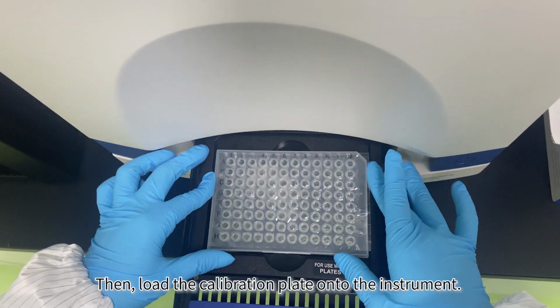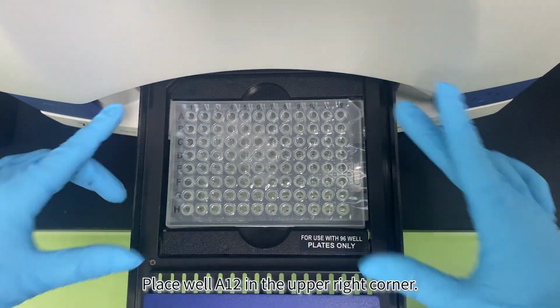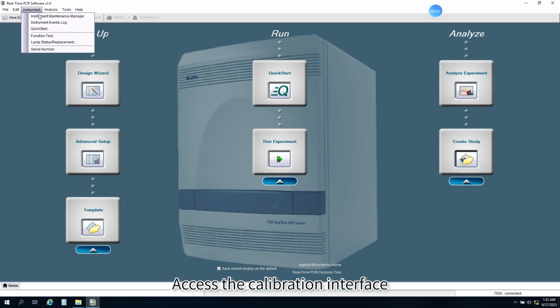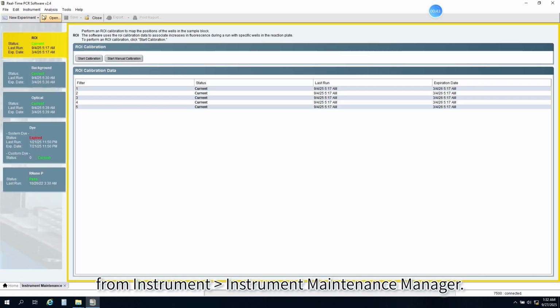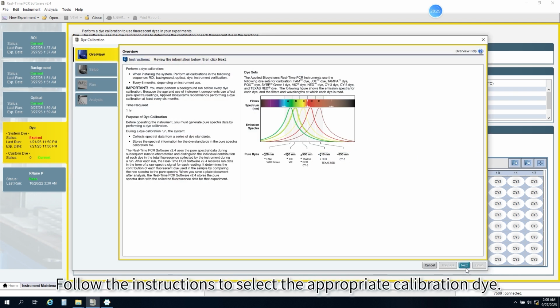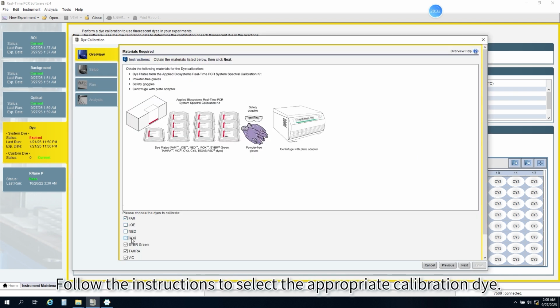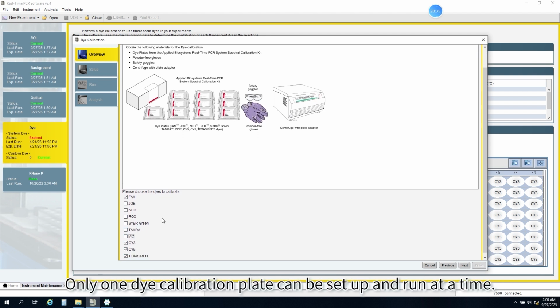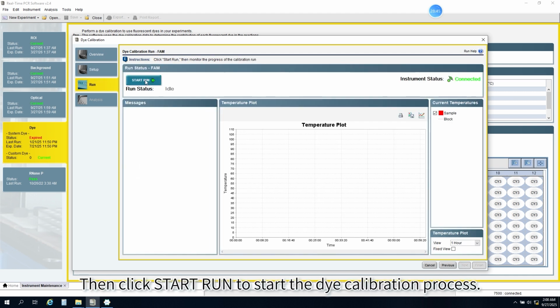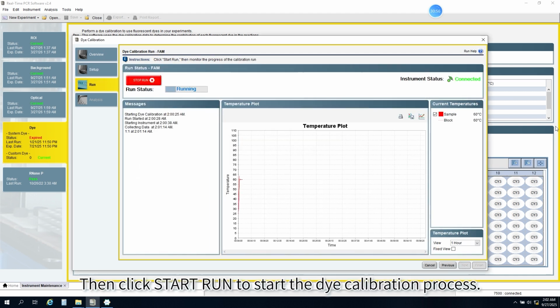Then, load the calibration plate onto the instrument. Place well 12 in the upper right corner. Access the calibration interface from Instrument Maintenance Manager. Perform dye calibration. Select System Dye Calibration. Click Start Calibration. Follow the instructions to select the appropriate calibration dye. Only one dye calibration plate can be set up and run at a time. Click Next to confirm the prompt. Then click Start Run to start the dye calibration process.